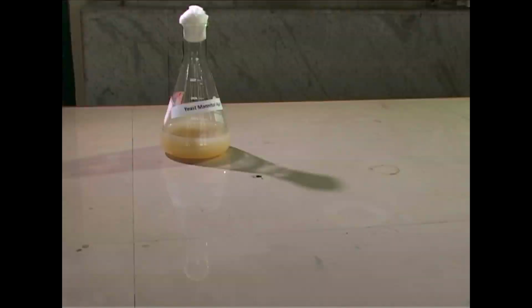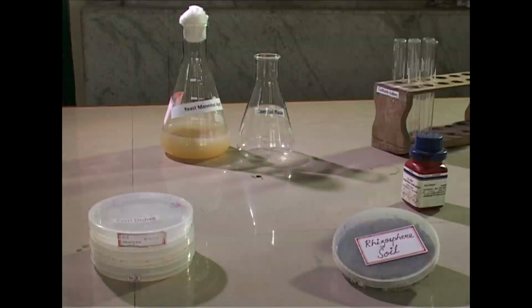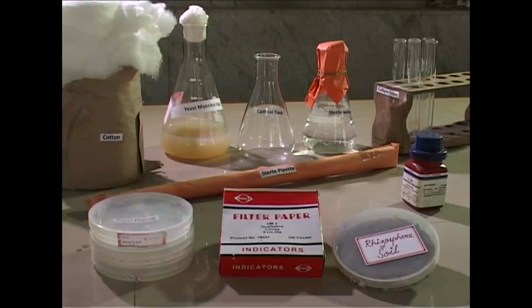The requirements are the medium, yeast mannitol agar, supplemented with Congo red, and the soil sample taken is rhizosphere soil. There are other requirements like petri dishes, conical flasks, culture tubes, sterile water, sterile pipettes, and likewise many other requirements like cotton and filter paper that are there in a microbiology lab.